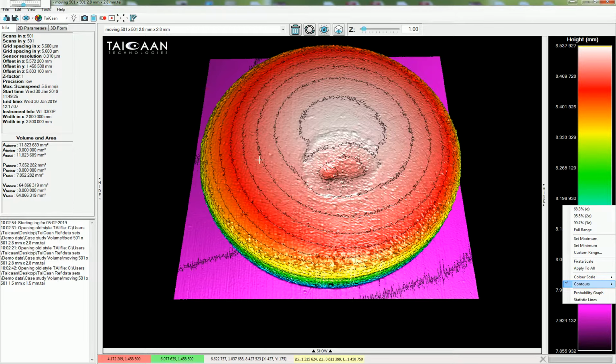So we need an underlying surface. And in this particular case, the best way of doing this would be to measure the wear relative to a spherical region. I'm just pointing the crosshairs to a spherical central region here. So what we did is we basically remeasured this. We took the original data set in the metrology frame and we just remeasured the central region. And that's my next data set.